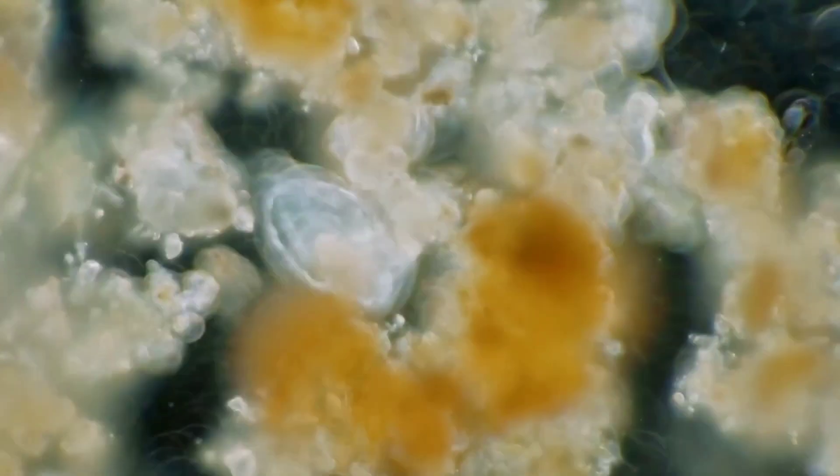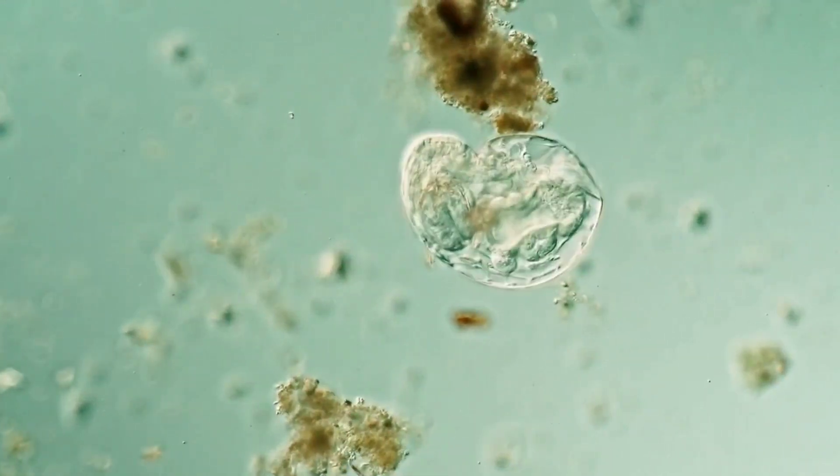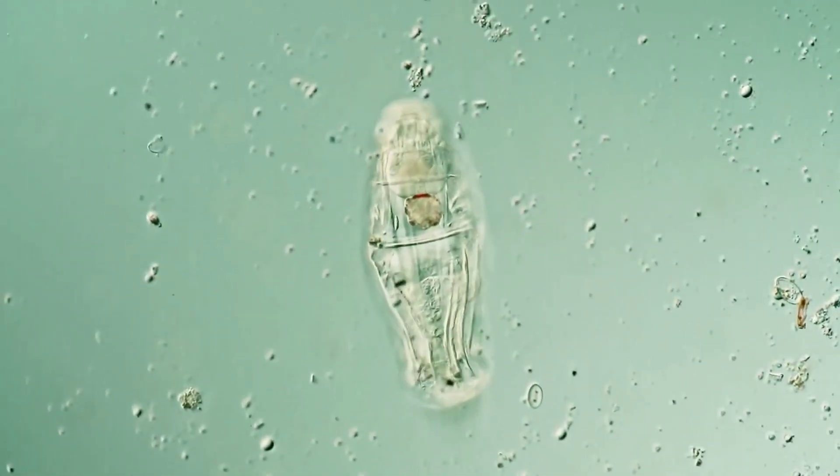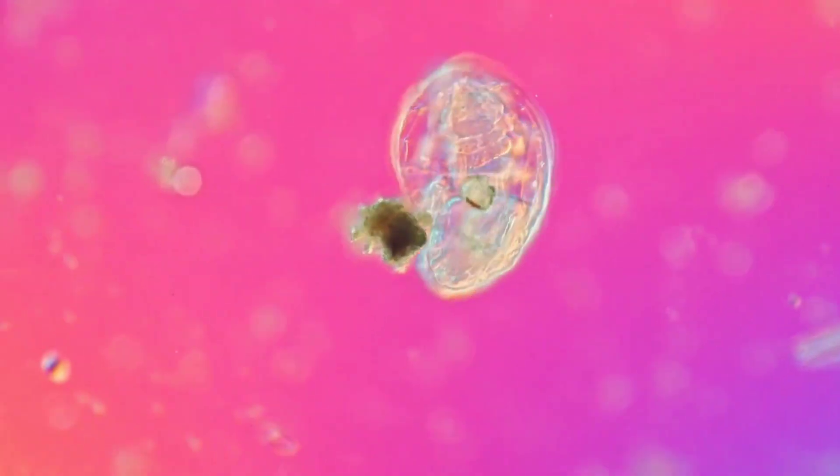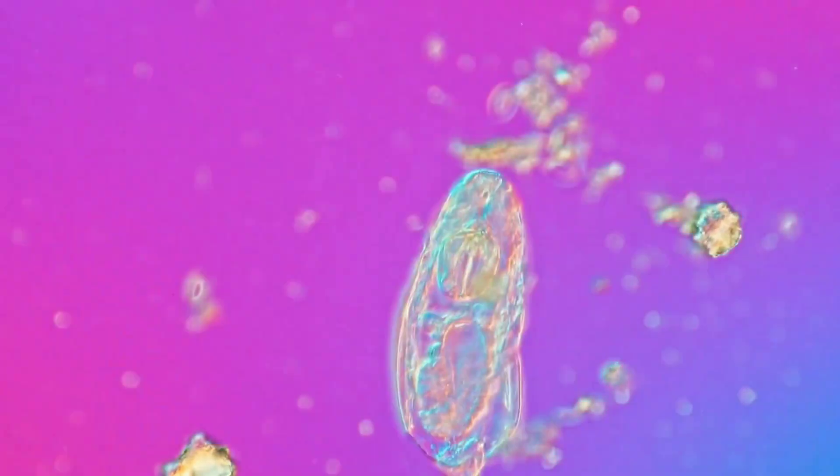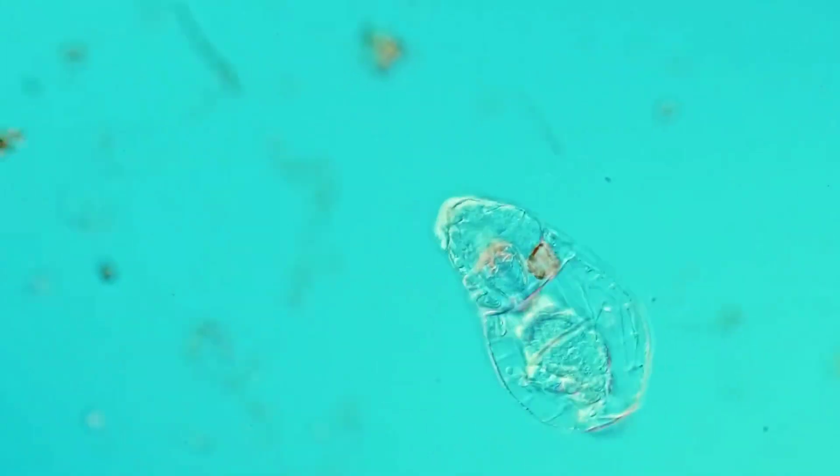There are three types of condenser such as Abbe condenser, Cardioid condenser, and Paraboloid condenser for dark field microscope. We need to ensure that the numerical aperture of condenser is greater than that of the highest power objective we will employ.